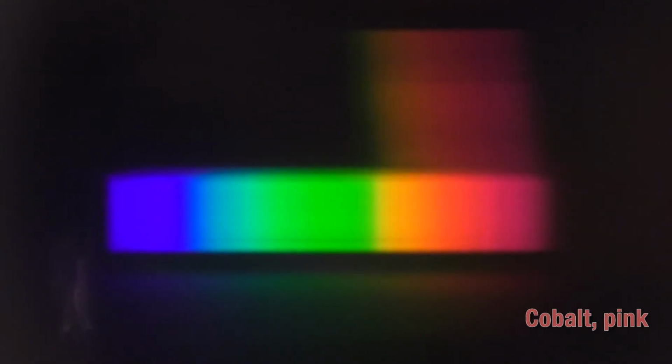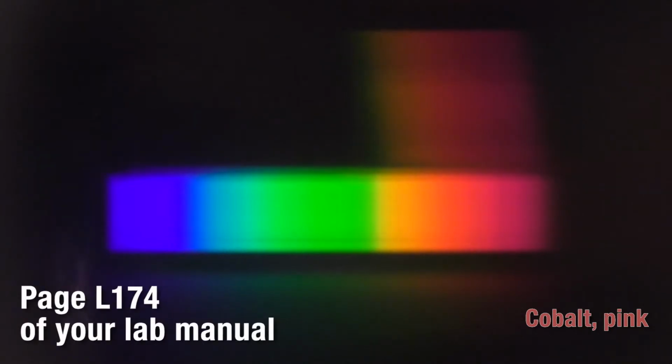You can pause the video and record on your data sheet what colors are absorbed and what colors are transmitted. The next one we're going to do is copper, which is blue. There you can see what colors are absorbed. Pause the video. It's helpful if you have some marker colors or colored pencils or something like that, but it doesn't have to be. You just mark it into the data table.